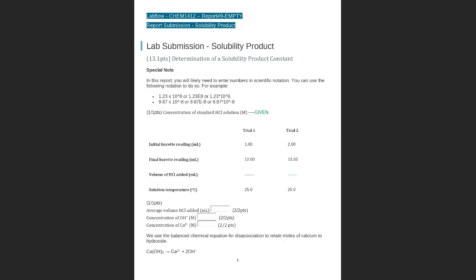If you read part B of the procedure, it says empty the saturated solution in the 25 mL volumetric flask into a clean... So basically you are measuring 25 mL of sample. Okay. So it seems that everybody will have 25 mL of sample. And yes, that's what you are going to have. Everybody will have that. Okay.